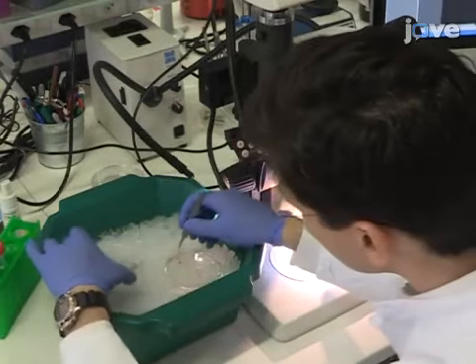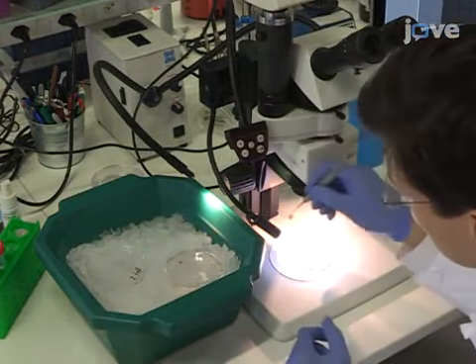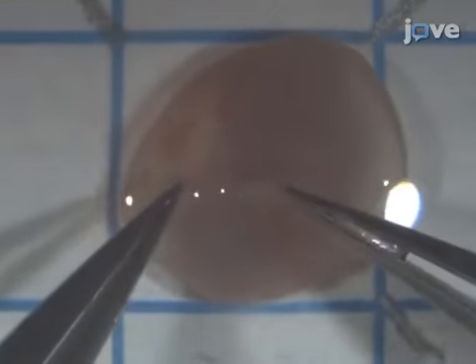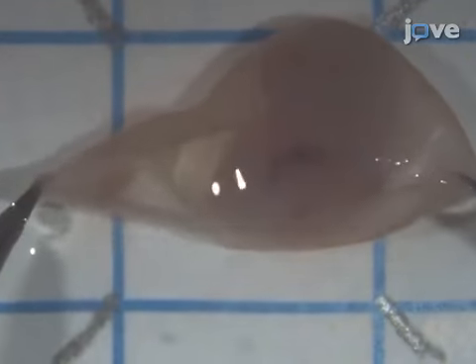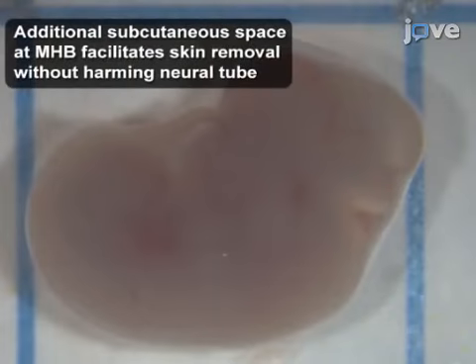Next, transfer the embryos into individual uncoated petri dishes filled with ice-cold PBS, which are placed under a stereo microscope. Use a pair of fine-tipped forceps to remove the embryonic hulls. Keep embryos in expansion medium on ice.